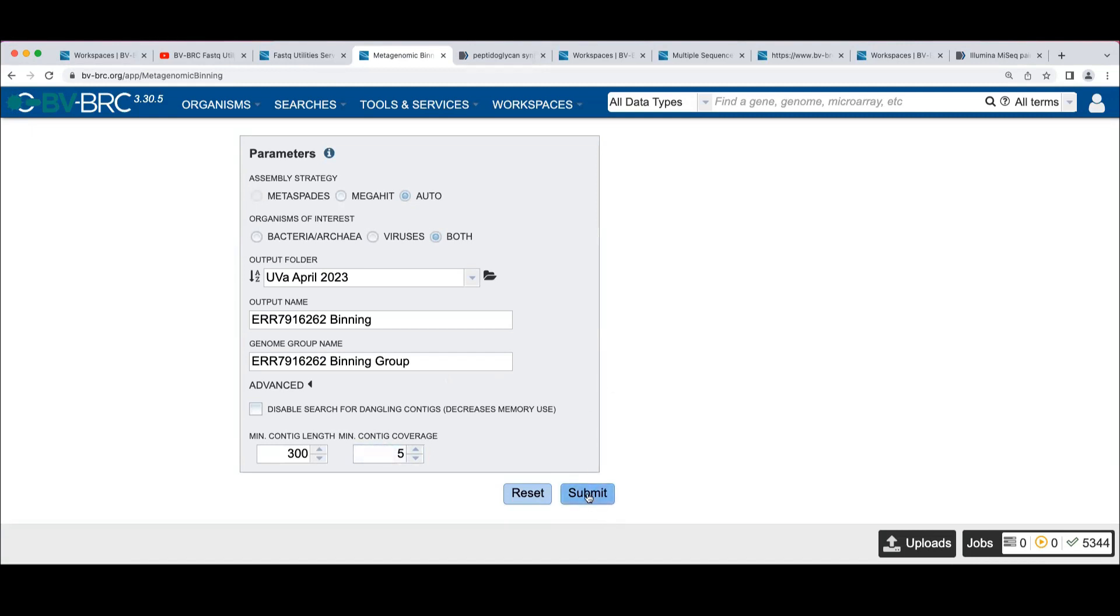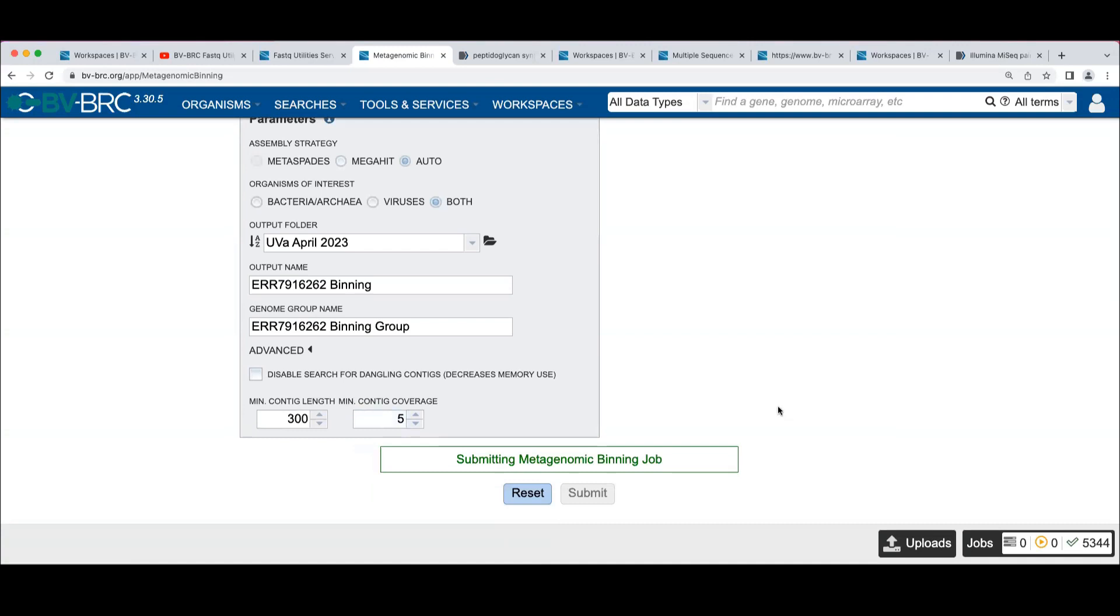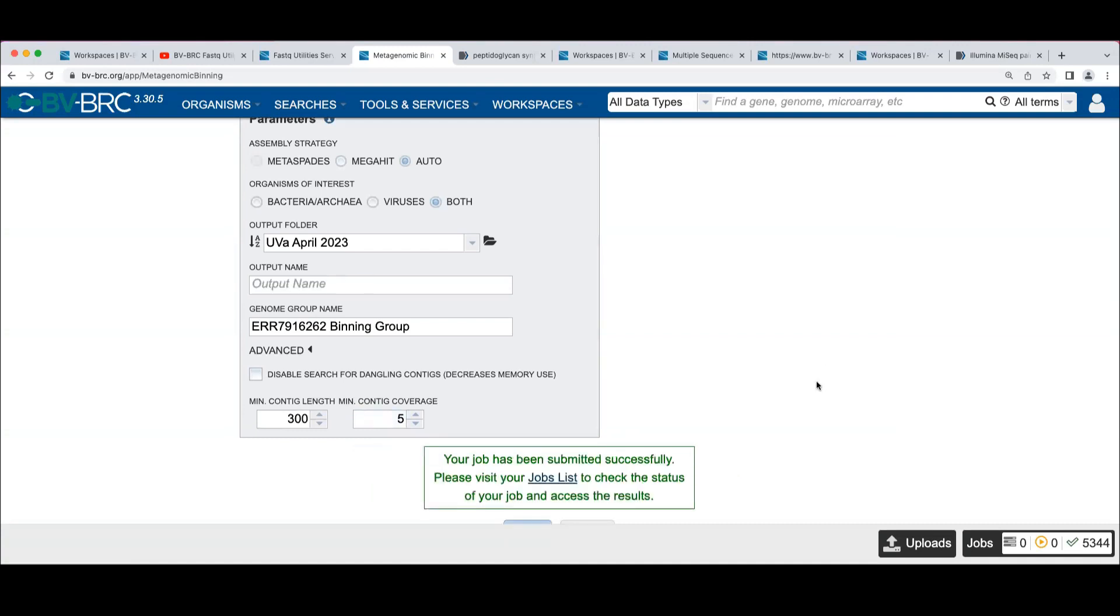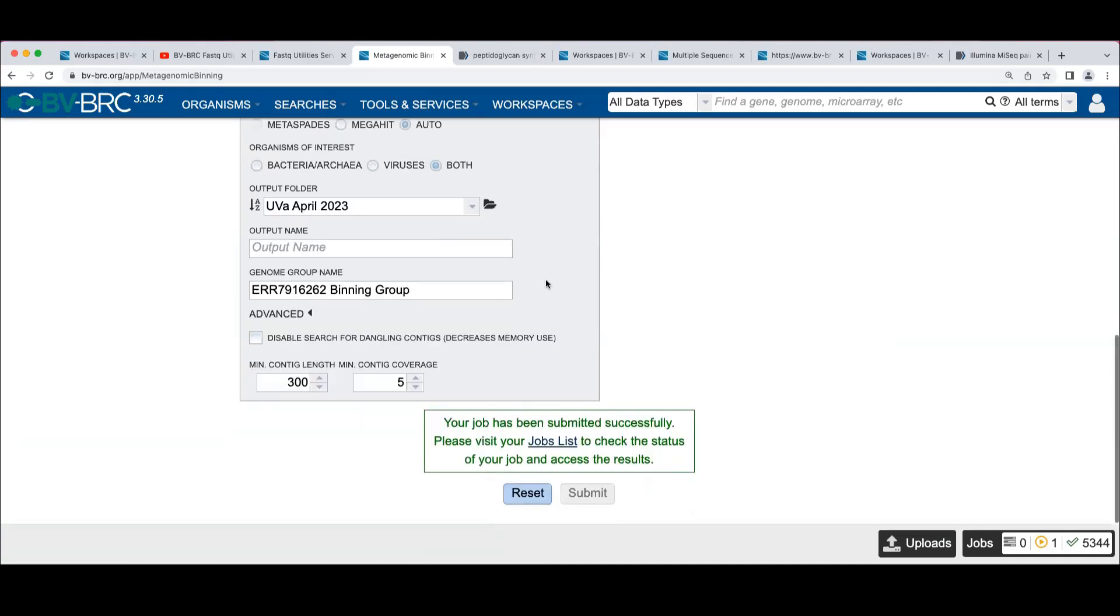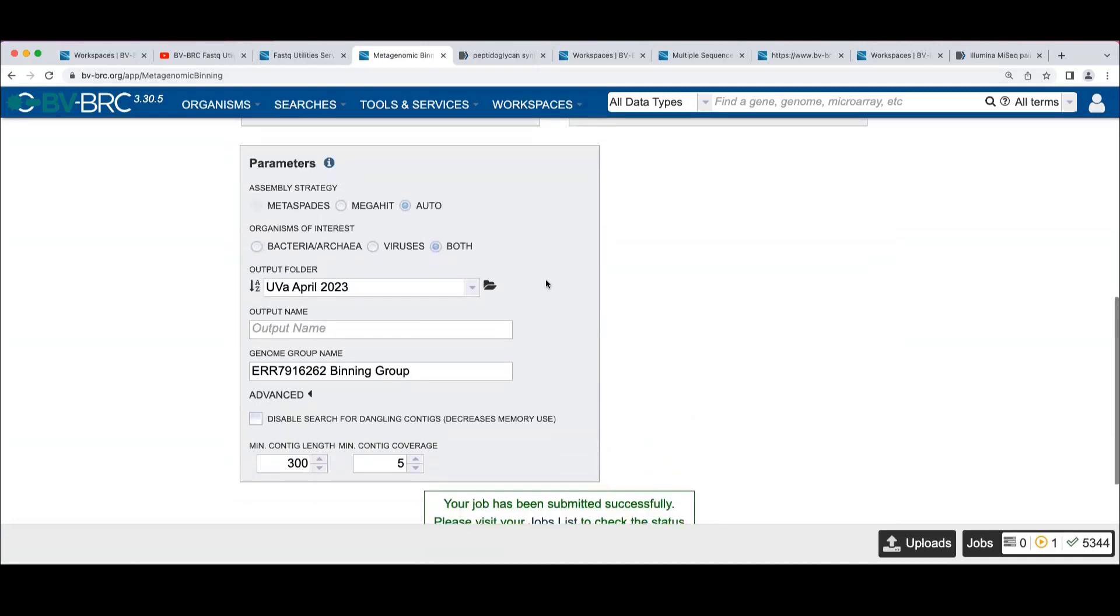So now we can go ahead and submit the job. Because this is assembly-based, these jobs can take a while to run, particularly because the large metagenomic datasets can take a very long time to assemble. The time spent varies based on the size of the job and the complexity of it. We've had folks that have submitted soil metagenome samples that can run for days, just for the assembly.